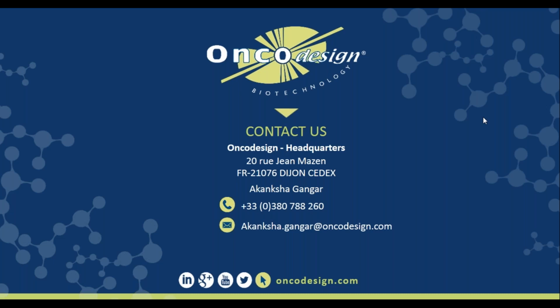Yes, the compound library, both our library and the Nanocyclix compound library, being small molecule compound libraries, were dissolved in DMSO. We've tested other compounds that were dissolved in PBS. That's possible. Usually when we do the screen, we test several different concentrations. So for each compound, we test between 5 and 8 concentrations. And the first 2 steps usually give us an idea of what time point we would choose for the next 2 readouts, which are long and time consuming to look at.